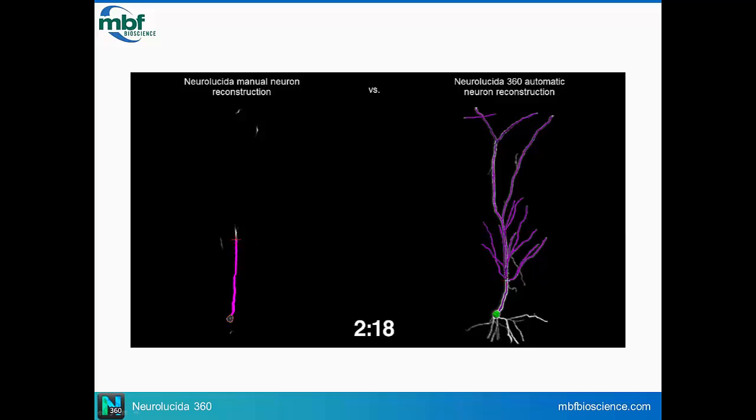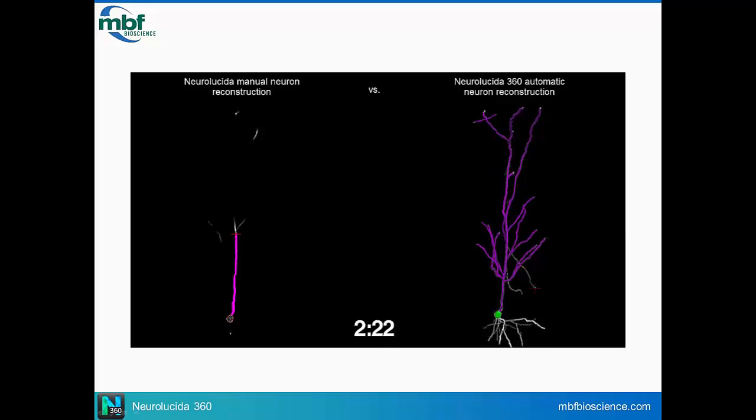So maybe you've got that beautiful neuron that Dara showed with that self-fill. Initially, she may just be interested in measuring the dendritic length to see if that cell from that animal in that group has a decreased apical dendrite length or something like that.